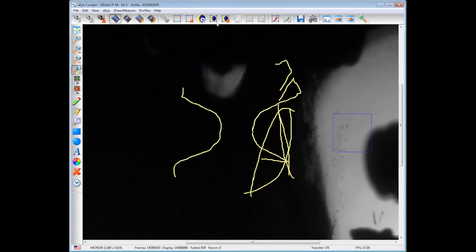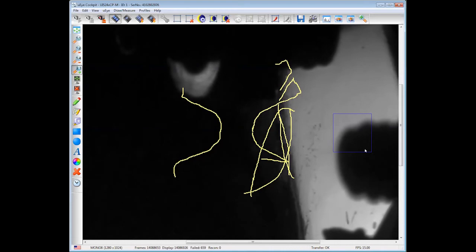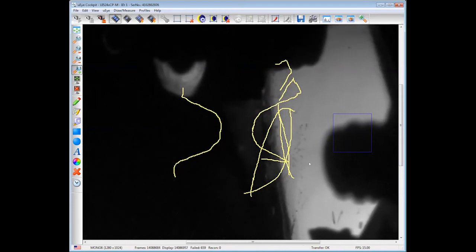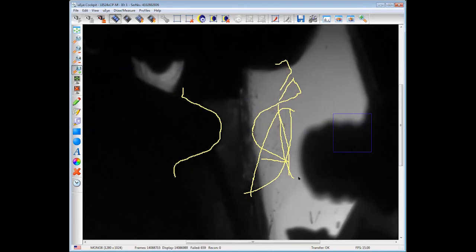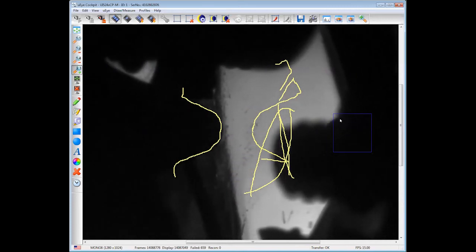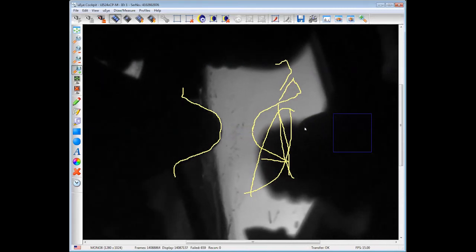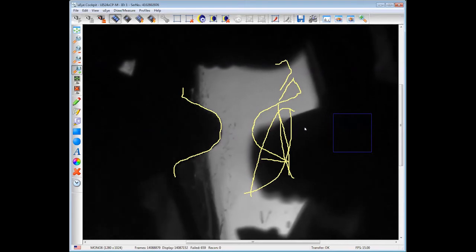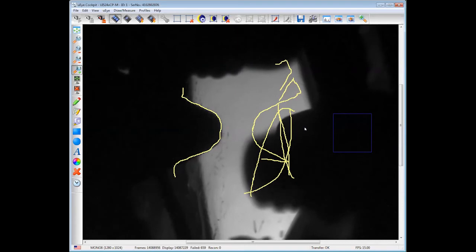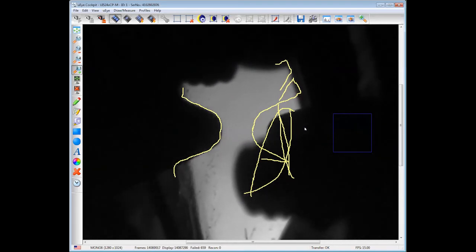I guess now you see the single crystal. There are some screws which are used to fix this crystal. So we approach. Okay, there is still no shadow. Okay, here I start to see some shadow. However, there is another screw which complicates the situation a bit. But I guess we can move it a bit up, like this.